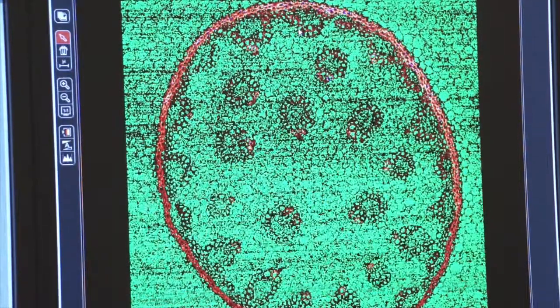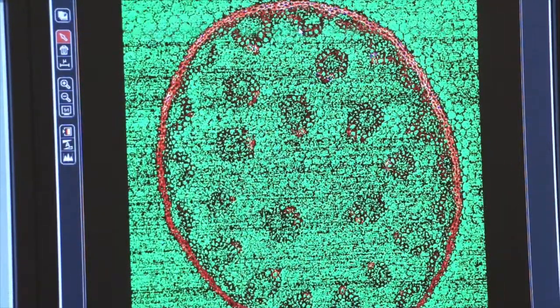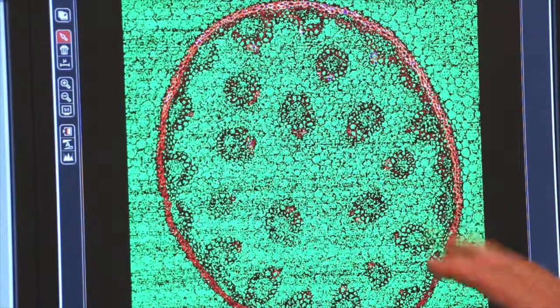And so by using the lookup table and the blue and green pixels, I can quickly decide where my smart gain and my offset should be.